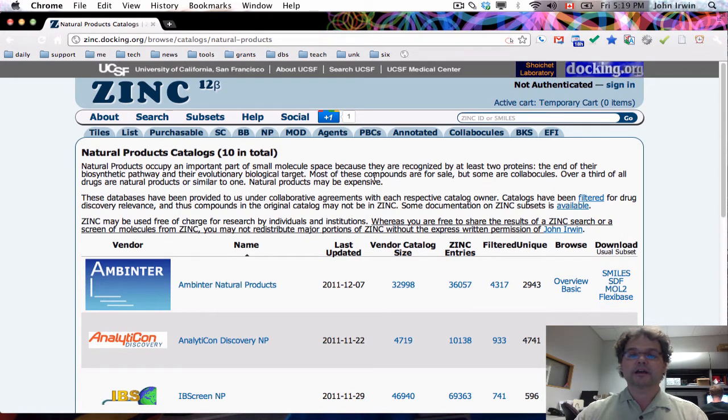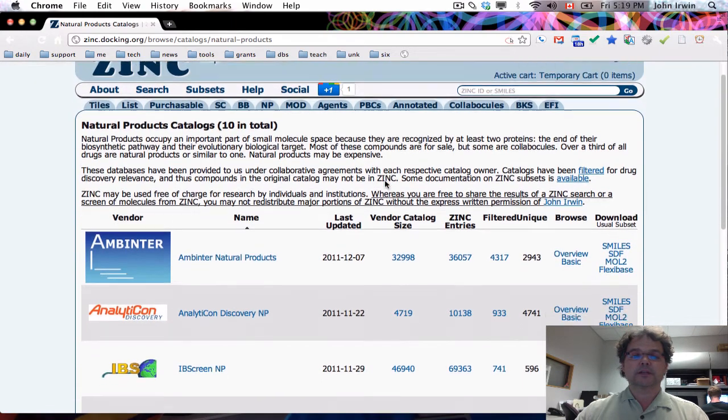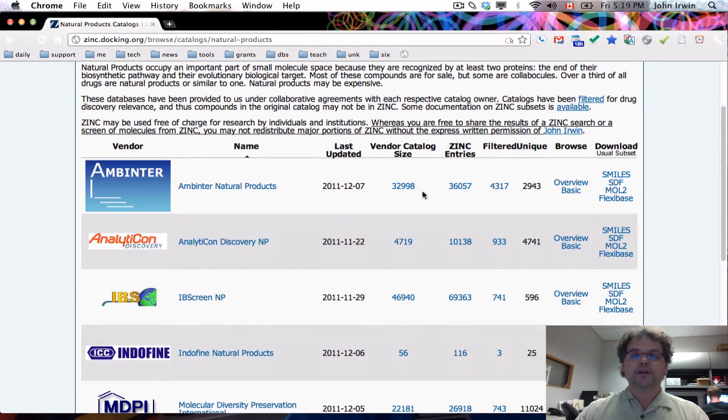There are 10 natural product catalogs in ZINC, and they're here below. In each case, we have a number of molecules in the source catalog, and then a resulting number that are in ZINC. How could the number loaded be higher than the number in the source catalog? The answer is some of those molecules may have been stereochemically ambiguous, and so we enumerated up to four stereoisomers per ambiguous molecule. We've also filtered out some molecules because they're just not compatible with docking. For example, vancomycin is a natural product.